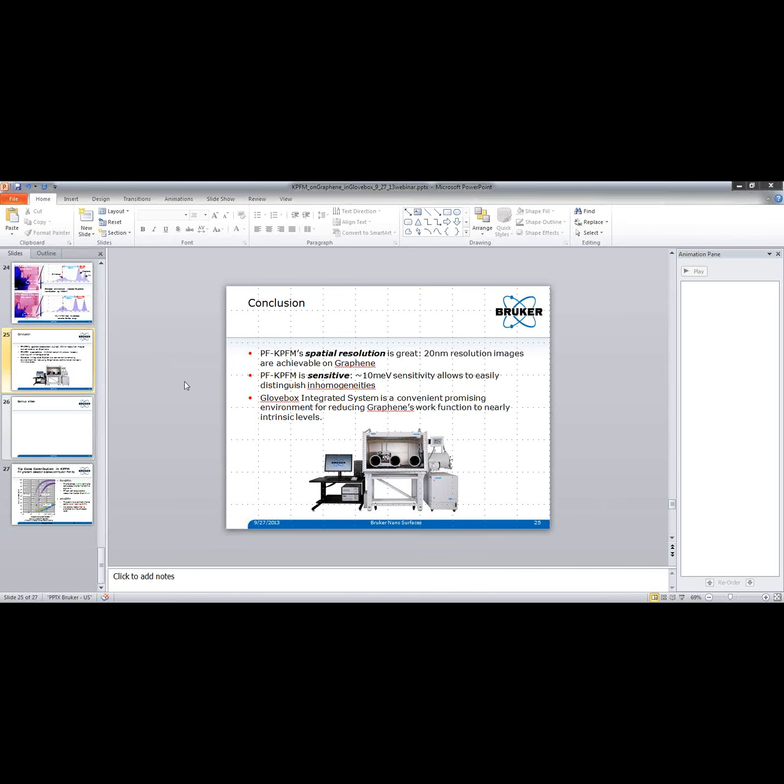But what happens when you have doping, or when you have inhomogeneity, like islands of electrons and holes, is that when you try to reach the Dirac point, you don't get 0 conductivity. You actually get fairly high conductivity because the electrons and holes don't cancel each other out.